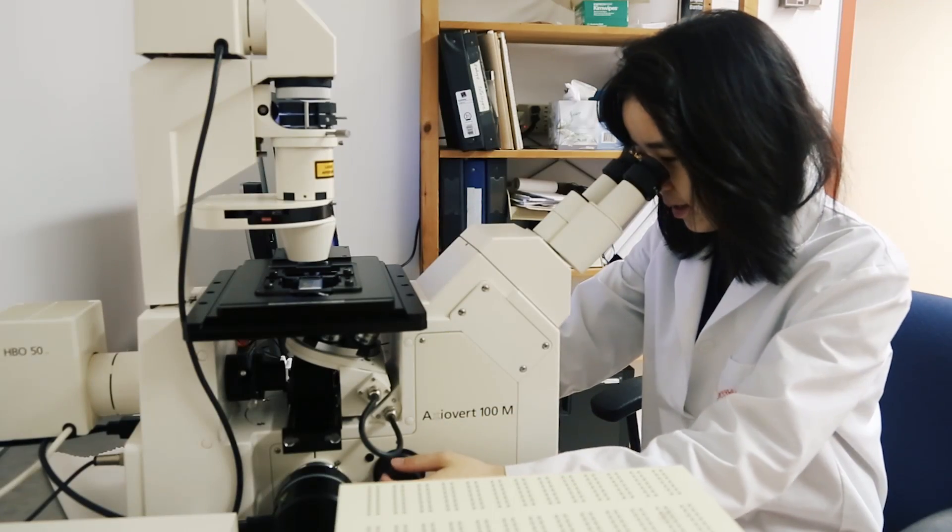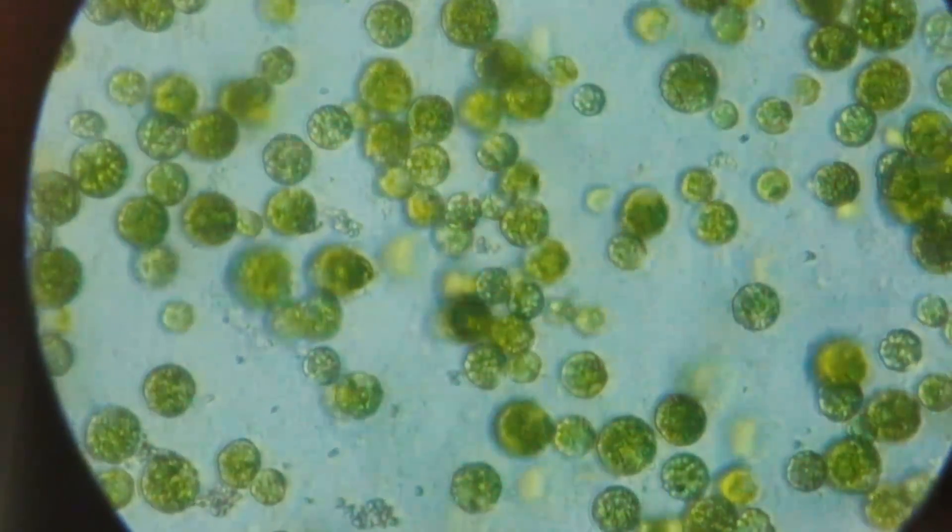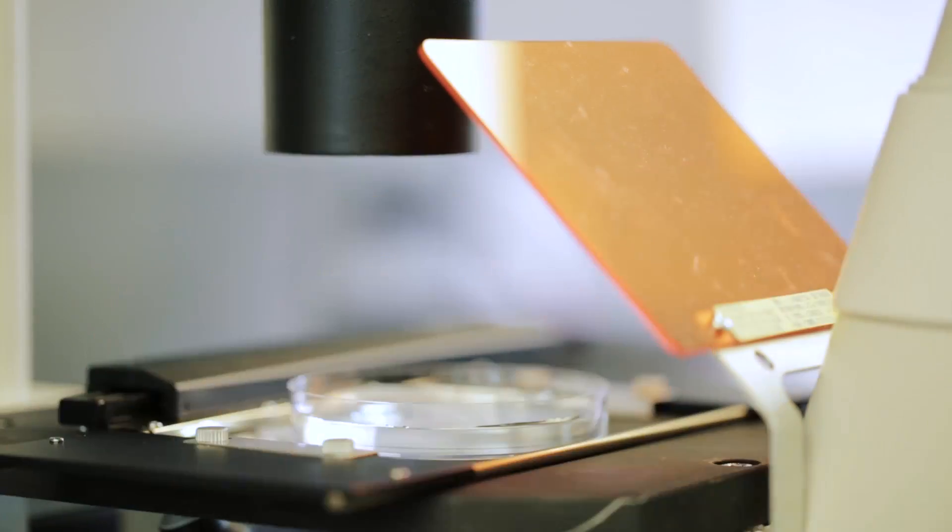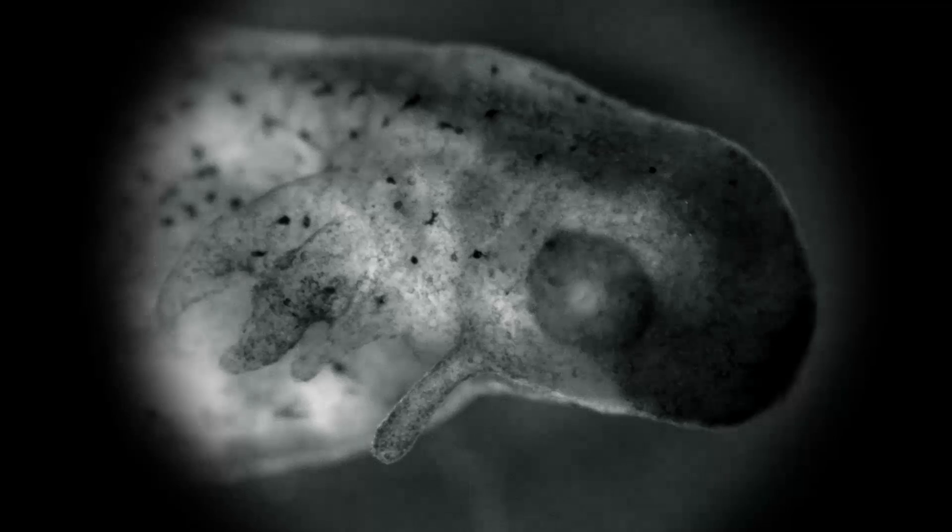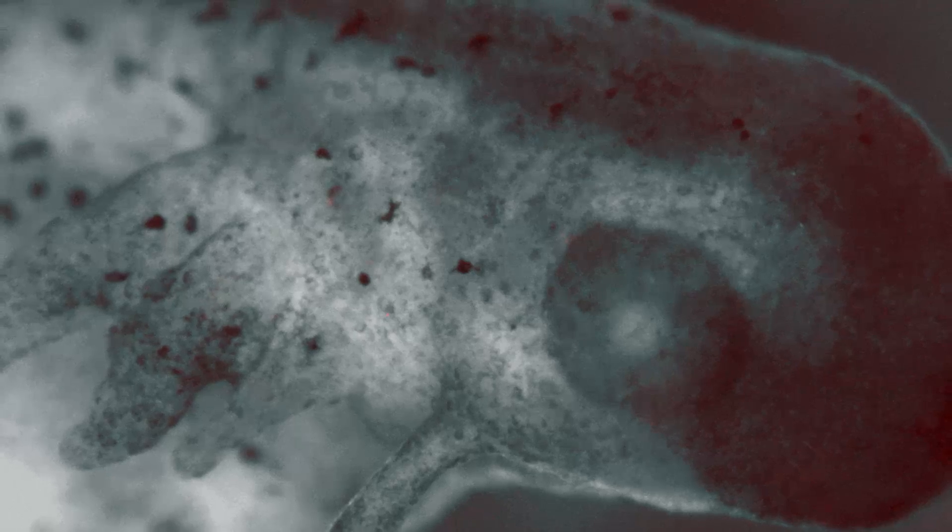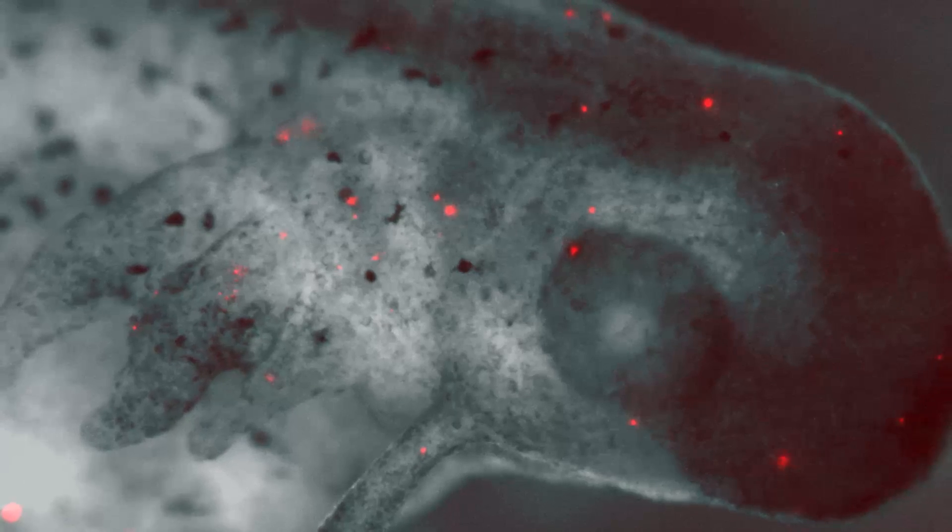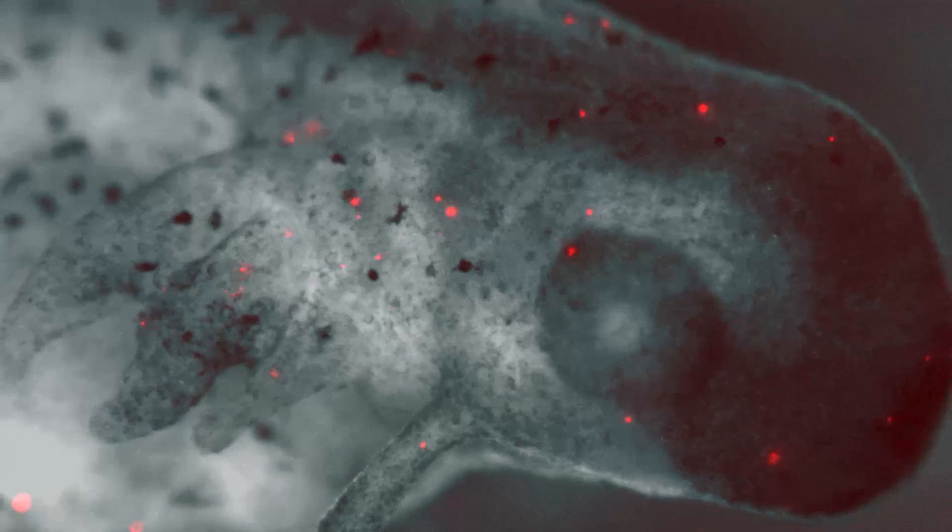We wanted to look at this association a little bit more closely through the microscope. The algae, like all photosynthetic life, has these pigments that fluoresce. That means that if we shine light on them of one wavelength, they emit light of a different wavelength. And basically on a lark, I looked at a later stage embryo with the fluorescent microscope to see if there was any sign of algae persisting near the time of hatching. And it was really surprising to see that there's algal cells embedded inside the embryo itself, inside the tissues. Then we wanted to look at the inside of cells.